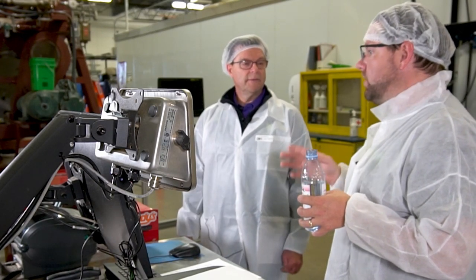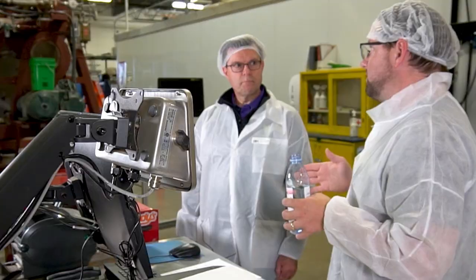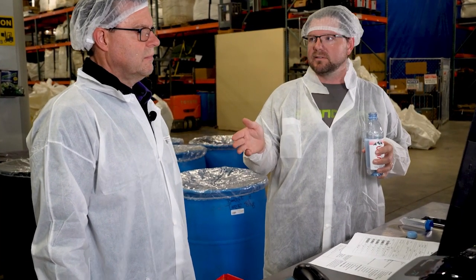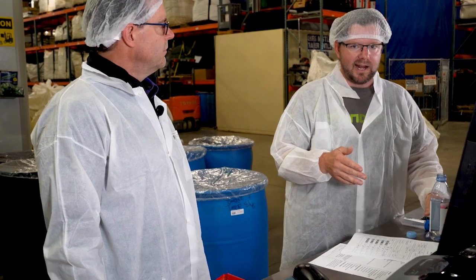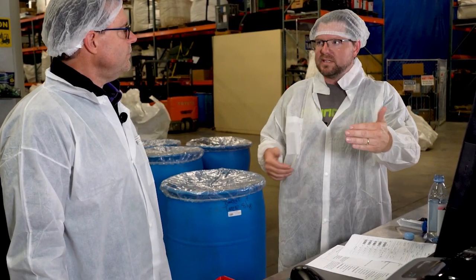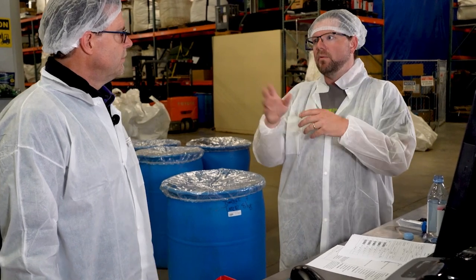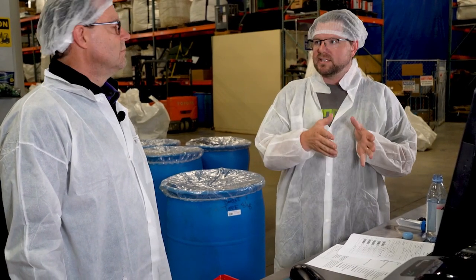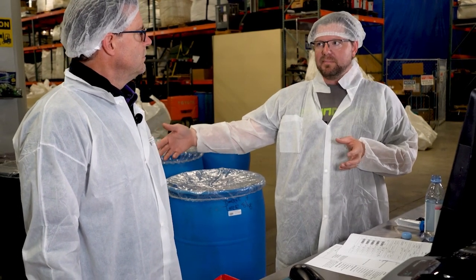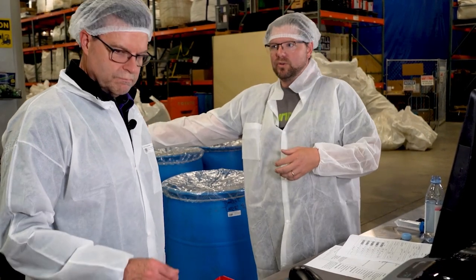Yeah, and you can suspend any process right in the middle of the process. You can restart it. You can go back and modify anything, because a lot of times what you'll do is set it up so that, okay, I'm going to run 30 samples for HPLC. I get them all prepared, and then I run them overnight. So that's suspended. And maybe I'll do half of the microbiological samples the next day, and then the next day I'll do pesticides.